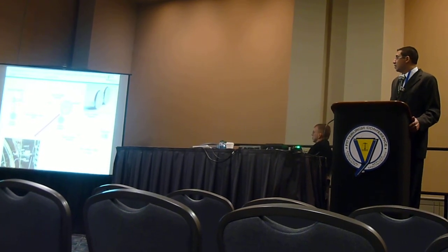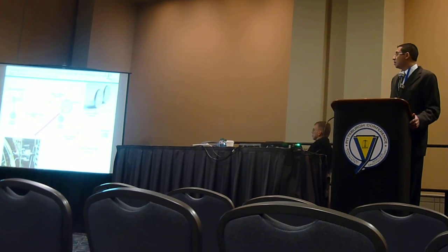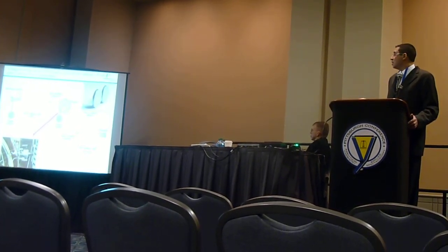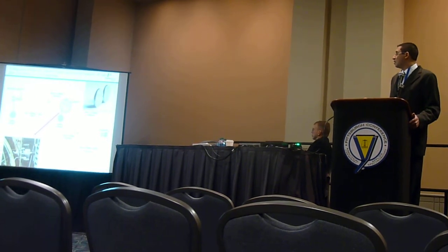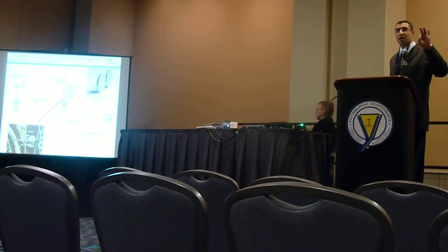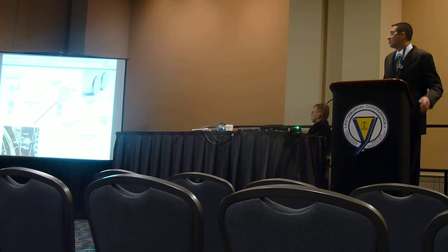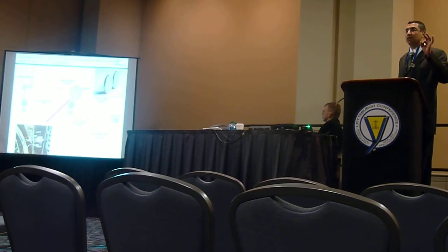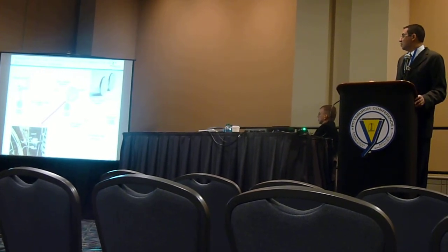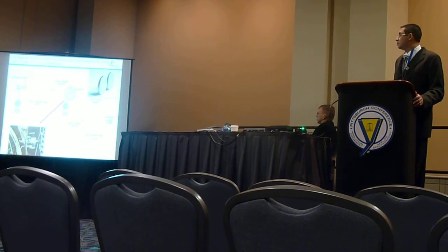So this is a capillary injector, splitless, and this is the pre-column. This is a Swafer. This is a switching device. In the next slide, you'll see it's the size of a nickel. It's very, very small actually. I have one in my pocket, so I can show you how big it is. It's about the size of a nickel, 5 cents. And at the end of that, this is the analytical column we use and the FID is my detector.